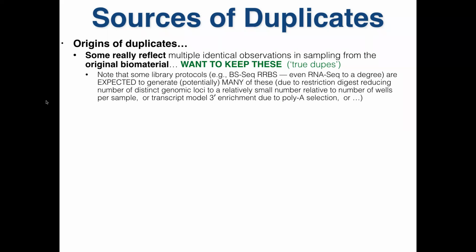Say you're in the human, which is a big genome, very expensive to sequence. So one choice is to trade away coverage on the whole genome and concentrate the coverage on a small fraction of the genome. That fraction is typically defined by a restriction enzyme. So you use a restriction enzyme, and now all of your reads start at places where that restriction enzyme cuts. It's not like you're getting reads uniformly distributed over the genome; they're all piling at restriction sites.